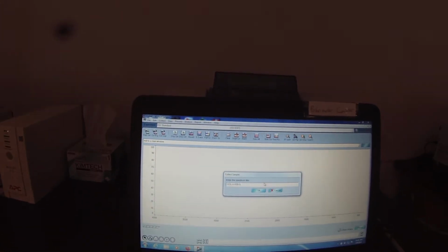DCL-10-65B-3. Number 2 was the failed pellet. And we'll see if that looks a little nicer. Background age you'll see is 5 minutes. That's perfectly fine. So that looks a lot better. We've actually got some resolution of peaks here.